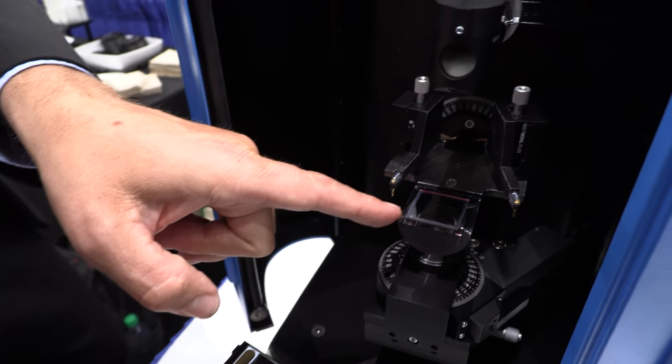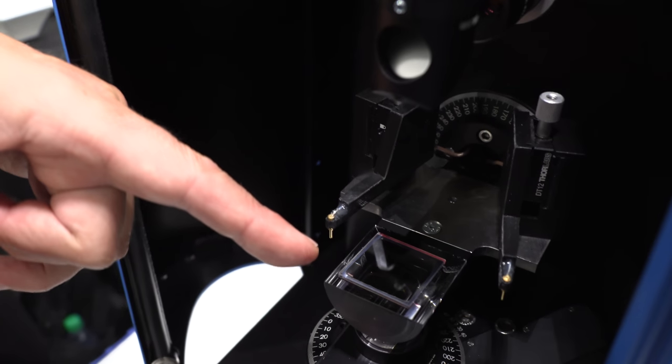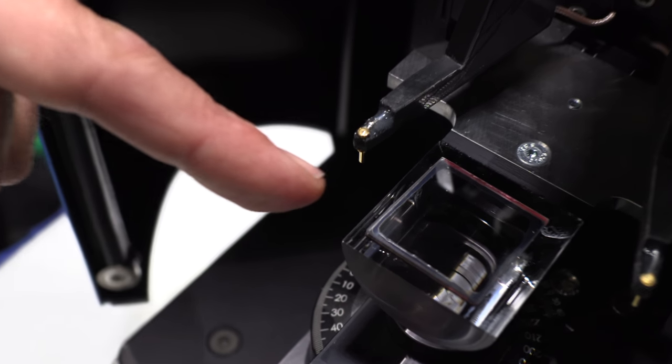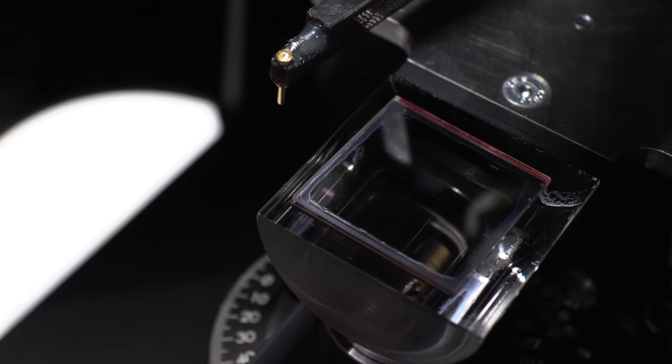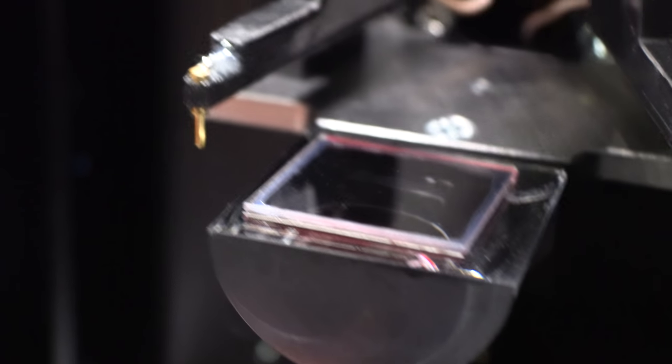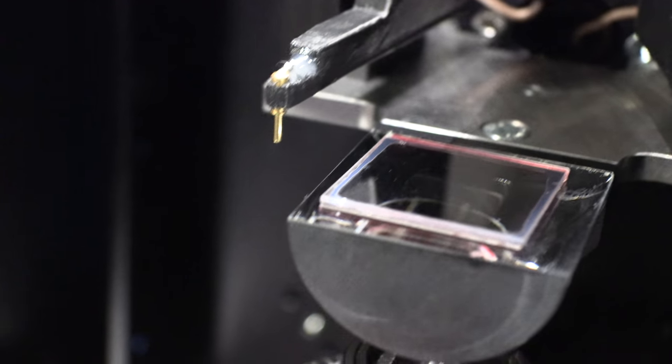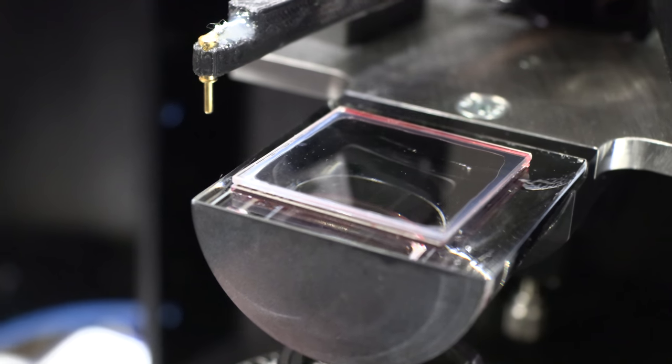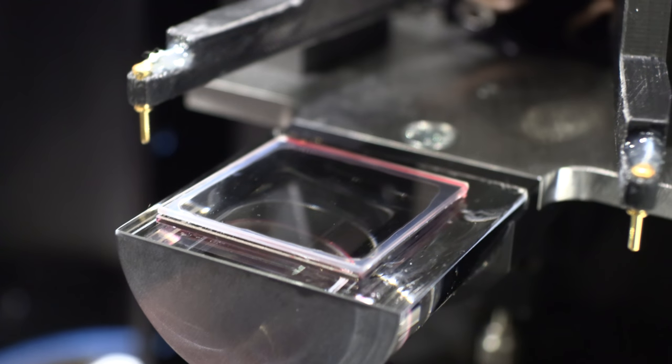We see here there's a glass and it looks transparent but you just saw before. If we illuminate with a blue light then it will luminesce in green. And this transparent layer is part of an OLED pixel in the end. So this is part of an OLED display or pixel?